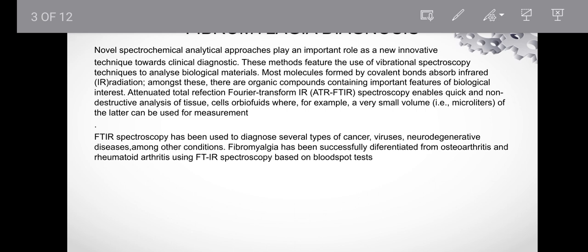So what we do is compare the data of these characteristic peaks with a healthy individual. We have already found the possible peaks of a healthy individual's blood plasma. We will be comparing and identifying the variation by using the spectral bank collected already. So there is a data set.